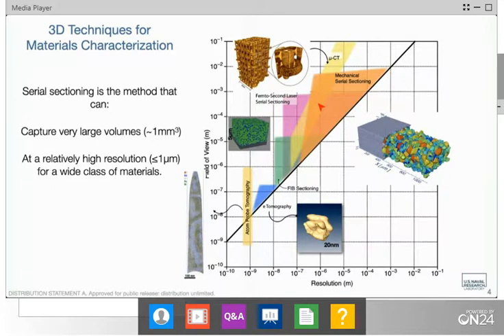And what I've plotted here is a rough estimate of your resolution versus your field of view. This line that runs through it is a magic line: you need to have a resolution of 10 voxels per item. So it really doesn't make sense to have anything that exists within this domain. You're talking about just not having enough voxels within your field of view to resolve anything useful. But the other point I want to make is that if you want to look at statistical microstructures, what we're really looking for are these very large left-hand edges.